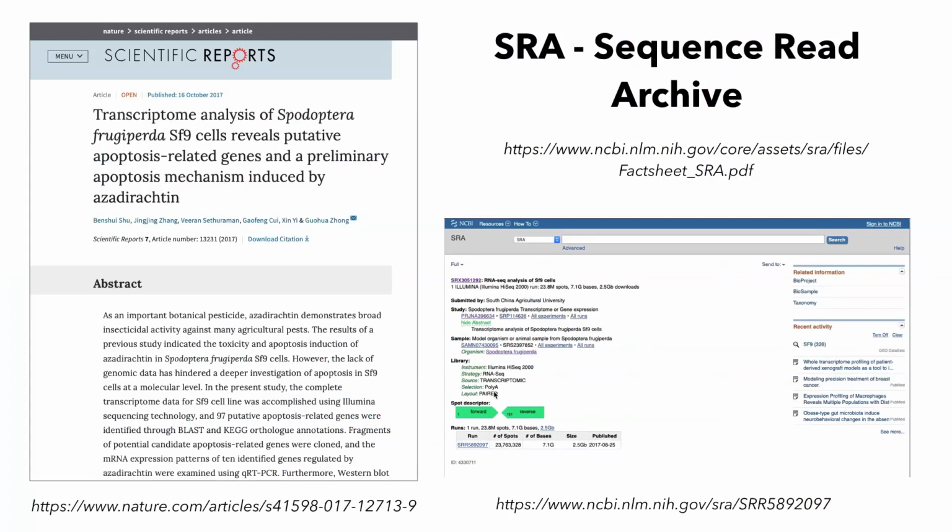And so at some point during the presentation, I want to give you a little bit of an overview of how you get that kind of data and how you can utilize it throughout this program as well. But this is just a little preview. So a lot of that data has been reposited with NCBI and is available for us to reanalyze, and the data sets that we'll be using, they all come from NCBI, the SRA repository.